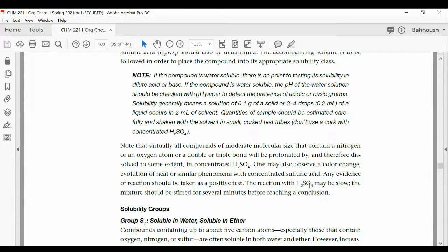I have the chemical reactions of the solubility of carboxylic acid and phenol in sodium hydroxide in the video. Please pay attention, and I'm even asking you to take a screenshot, make sure you know those reactions, because at least 2 of them would be on the exam. It's already recorded here. I don't want you to get to the exam and say, I just missed that part. You get a lot of questions from experiment 18 in the final exam, and you see the type of question in the video, so make sure to watch it.